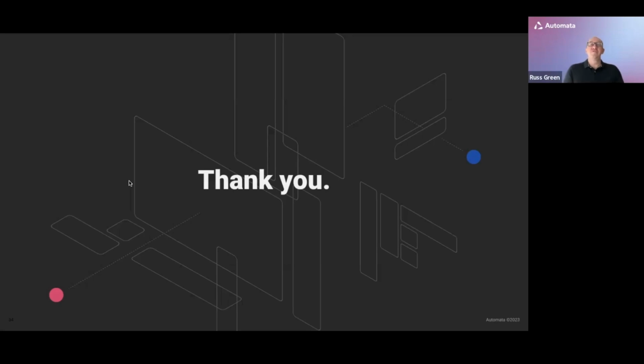Yes. The short answer is yes. There is, as always with these things, complexity to it, and it depends on exactly what you want to do. But we have designed systems already which are taking data. In fact, we have a reference site at the Crick, and incidentally there's a webinar about that system next week, which is a completely different space. It's a genomic system, but it's running QC for a sequencing process, and so we're taking data from plate readers, adapting that into a new work list for the liquid handler, and then driving a new set of operations. And that's a fairly simple version of what we're describing here, which is data-driven automated steps.